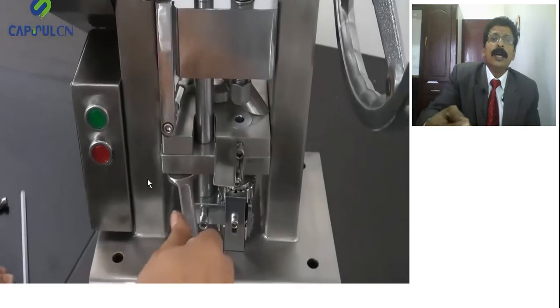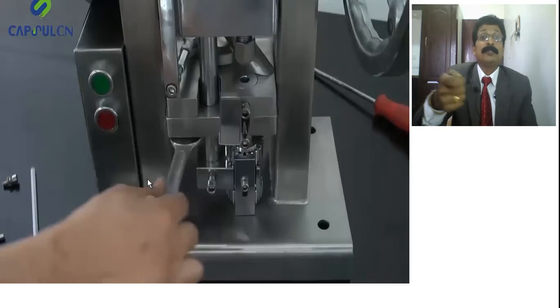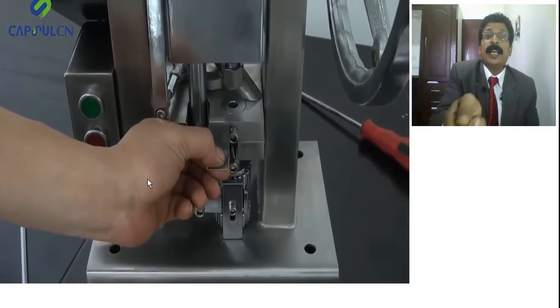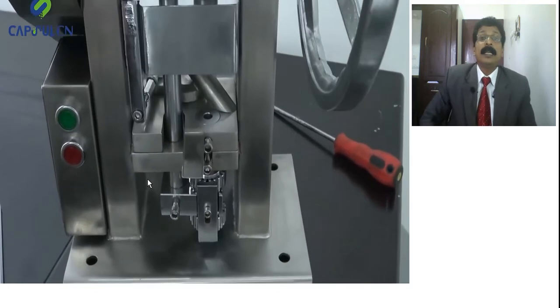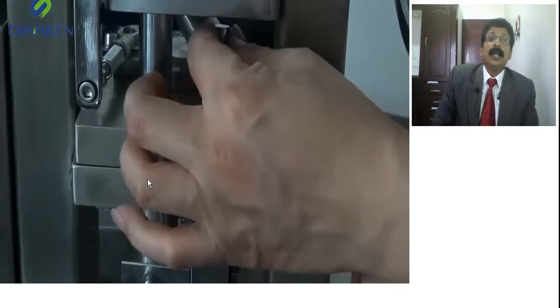Now you have to tighten, but not highly tight, keep it light, because you still have more punches to fix. So not fully tight, slightly, so that it still has a small shake. Afterwards it should not shake, but you still have more work, so do not make it very tight. Now, taking the punch, this is the lower punch.